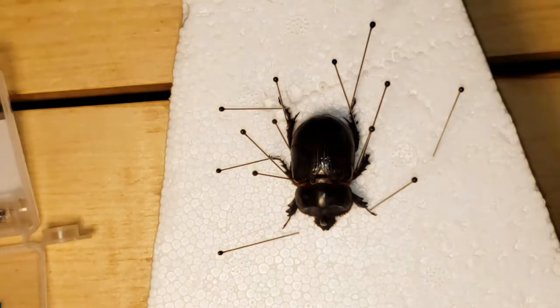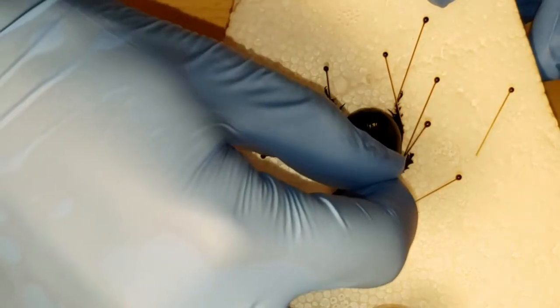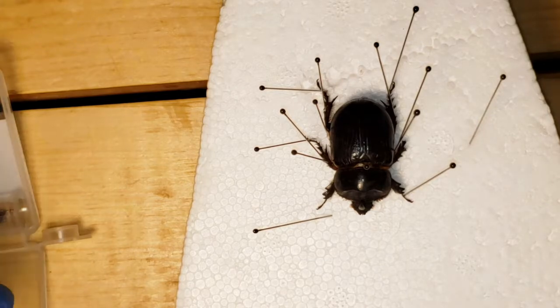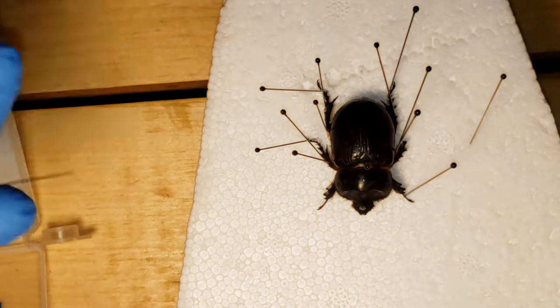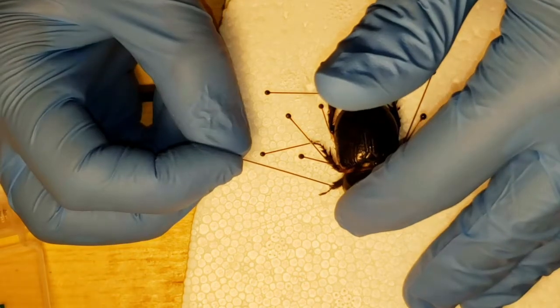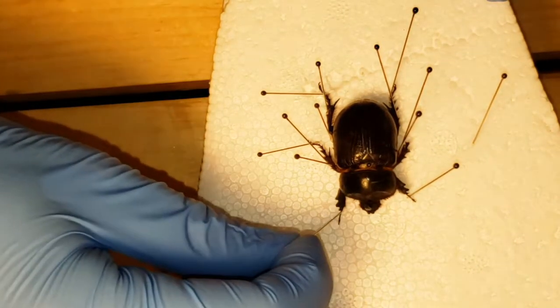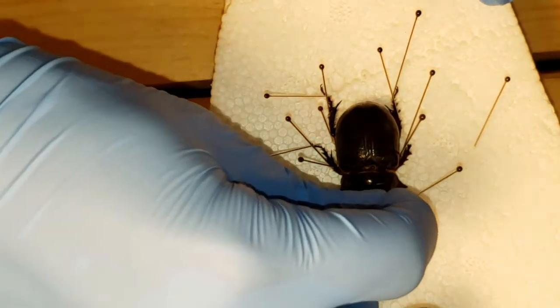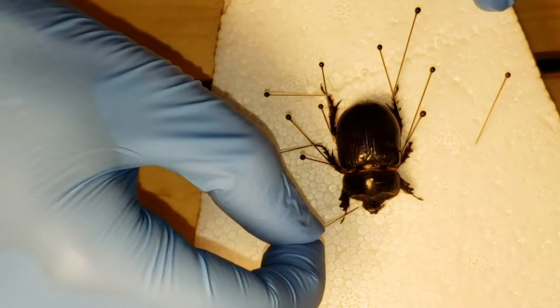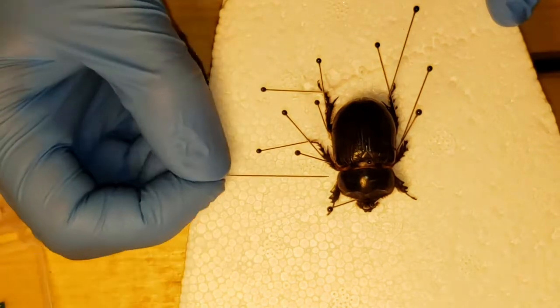Notice he's missing some tarsi on the left side and he's not super straight, so let's straighten him out a little bit. In this case where the leg's not going where I want it, I'm going to pin the head in a specific position and then move the legs where I want them.